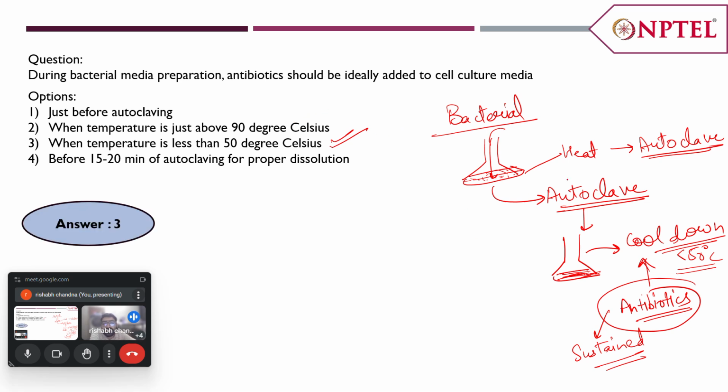And if we add it before autoclaving, then it will be degraded. So there is no point in adding the antibiotic before autoclaving. Okay, so any doubts in this particular question?